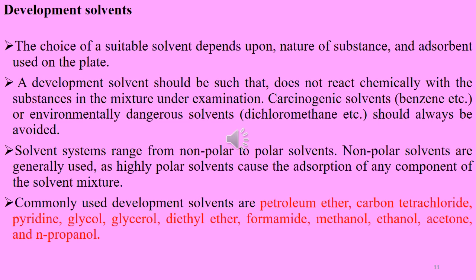Non-polar solvents are generally used, as highly polar solvents cause the adsorption of any component of the solvent mixture. The commonly used development solvents are petroleum ether, carbon tetrachloride, pyridine, glycol, glycerol, diethyl ether, formamide, methanol, ethanol, acetone, and N-propanol.